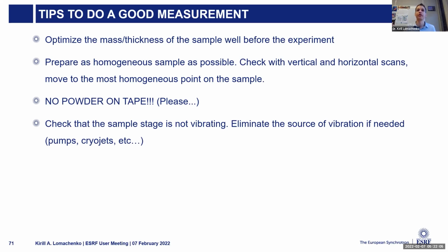And what can be not stable is actually the jets, or let's say the flow of warm air that can be around your sample. So if there is a turbulent flow, if you heat your cell, the air around it gets warm. Warm air, hot air, absorbs less than cold air.